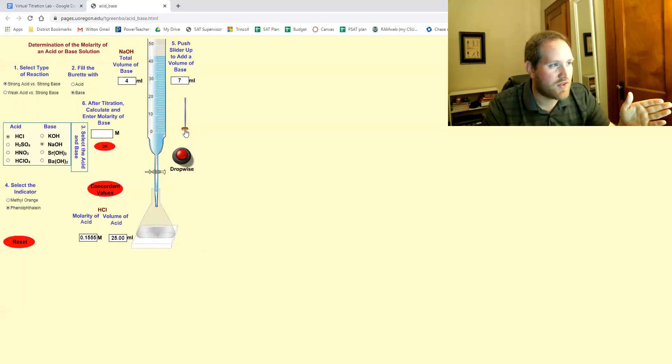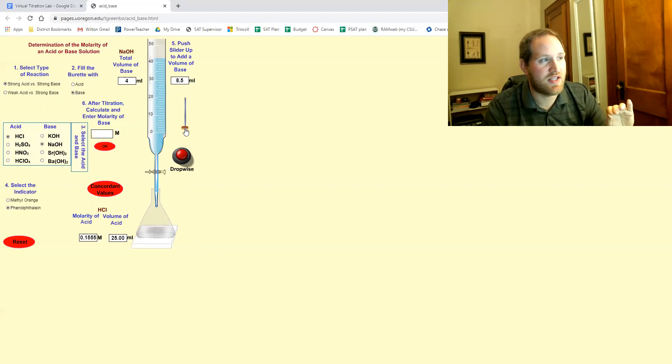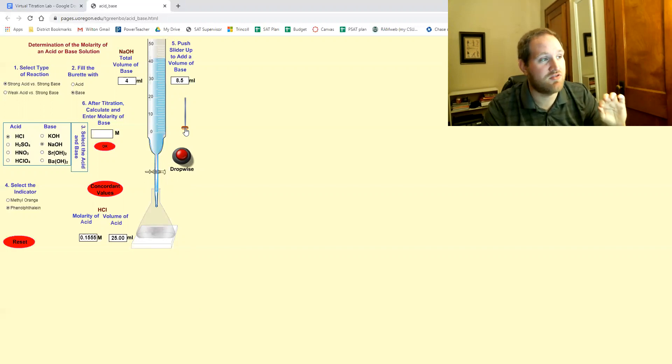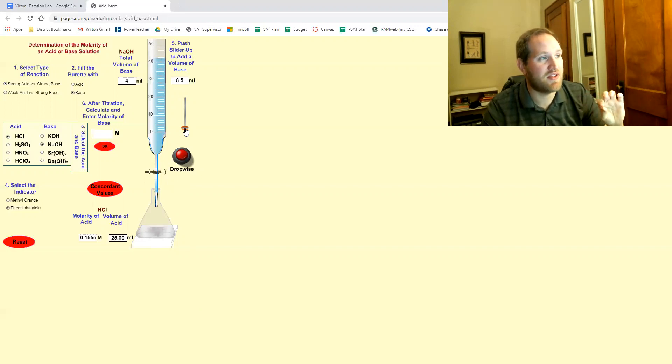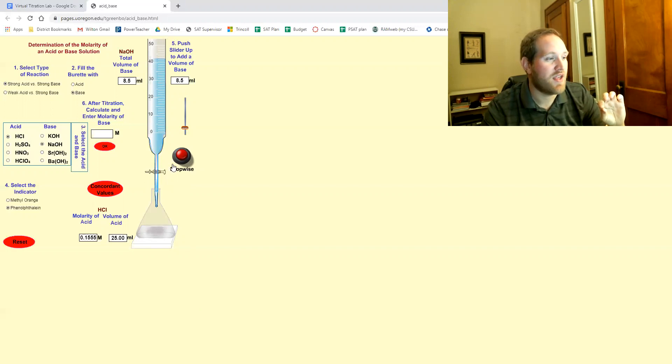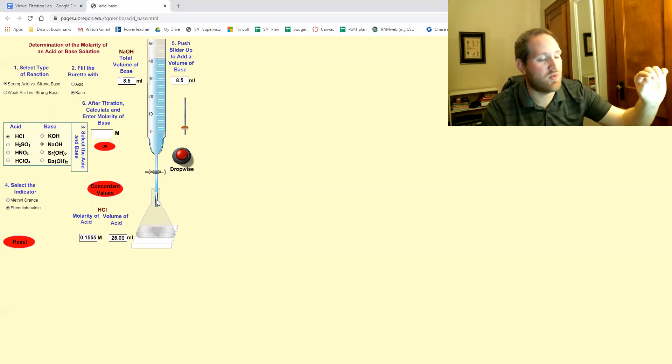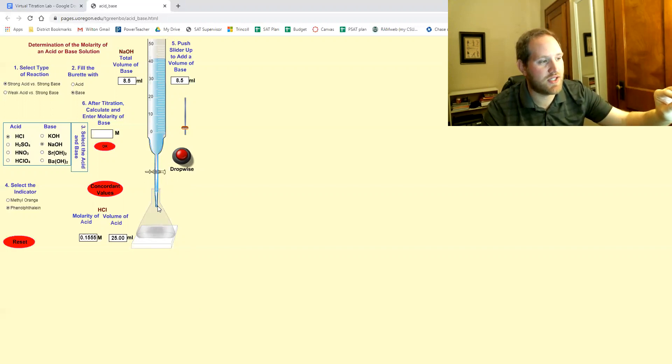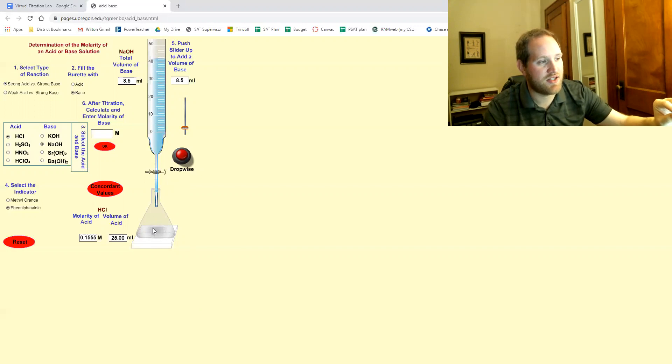So let's say I'm doing this incorrectly and I'm gonna add big chunks at a time. So let me drop it there. That's another four and a half. And what you do is when you release it, notice you get blue liquid that drops out of the burette and hits this.